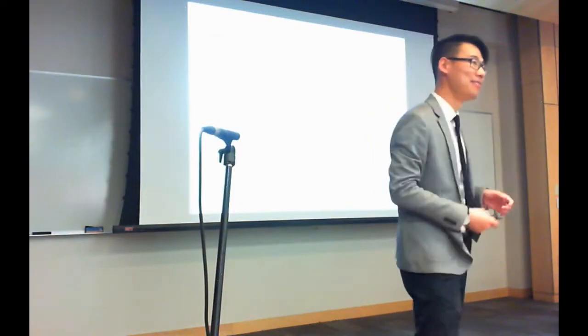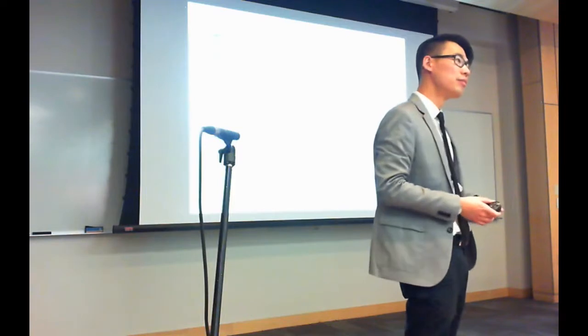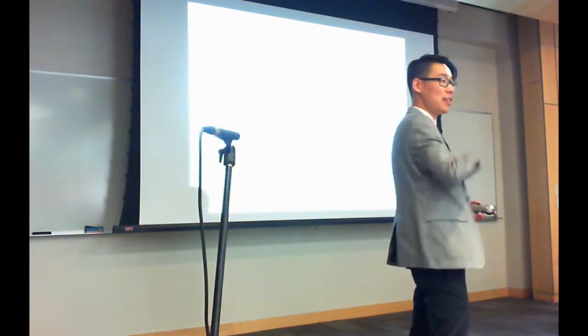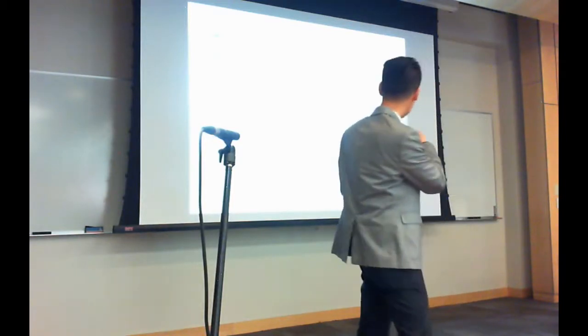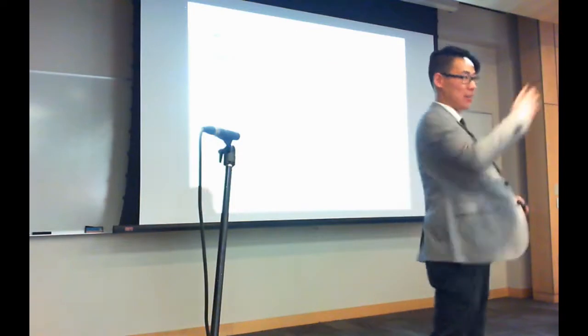Yeah, Bahar. How do you choose your delta? Are they just the most prevalent modifications, or how do you choose the list? So the delta is chosen because we actually know the full mass of this molecule. We first weigh the molecule exactly, based on the precursor.